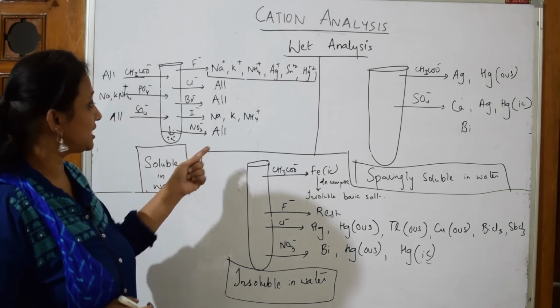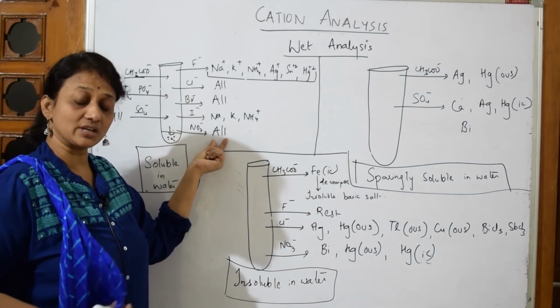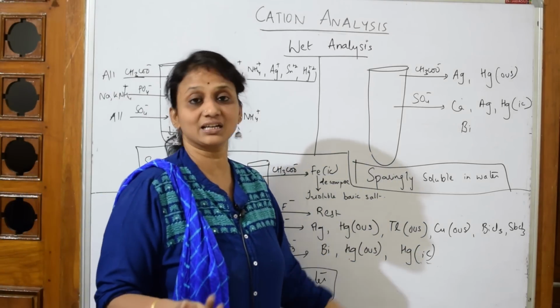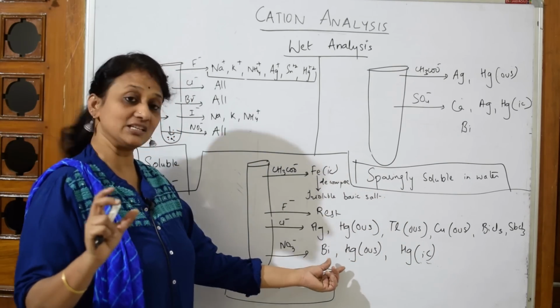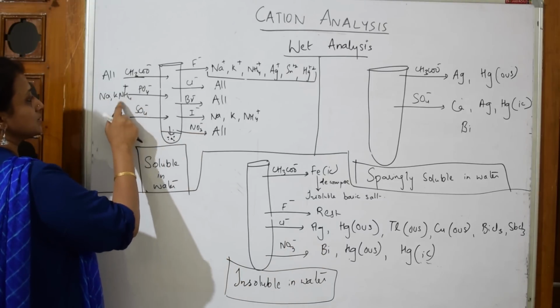Now, what is different? Let us see. Is there anything sparingly soluble? Not there. Here, yes, it is there. See here. All nitrates are soluble except bismuth nitrate, mercurous nitrate, mercuric nitrate. Some schools may test that. So such particular thing, it is insoluble. So you have to see this, compare with that and this. Easy, isn't it? Now let us come back to phosphate.